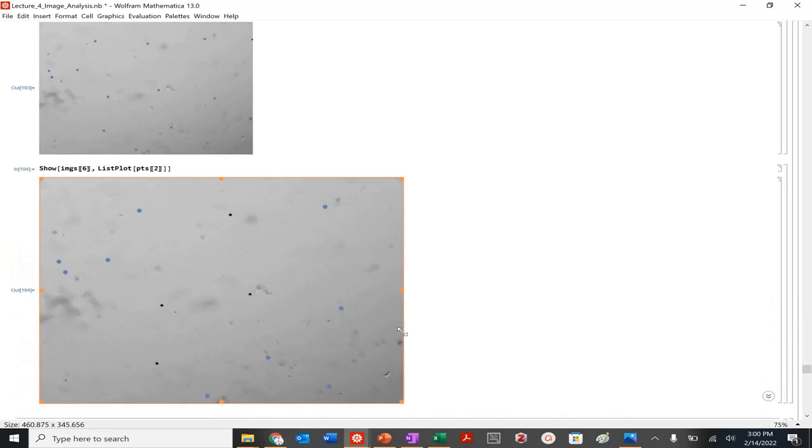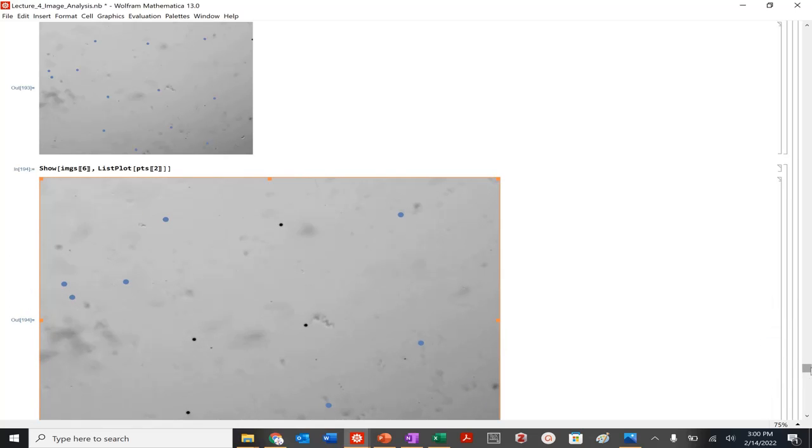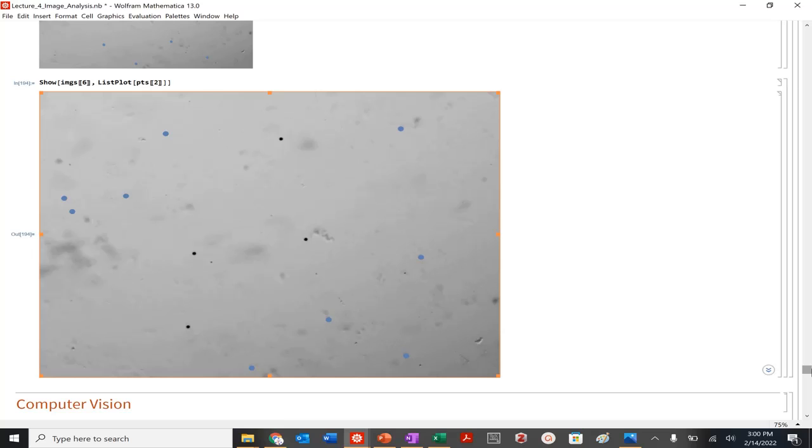You may be asking, why didn't it track it? What's going on here? Well, again, they're moving quite a large distance between image 1 and image 6, so it can lose the feature depending on how far away it is. You will work in your problem set on how to develop a program to track all those particles, maybe looking at nearest neighbors. But anyways, that'll be fun later.